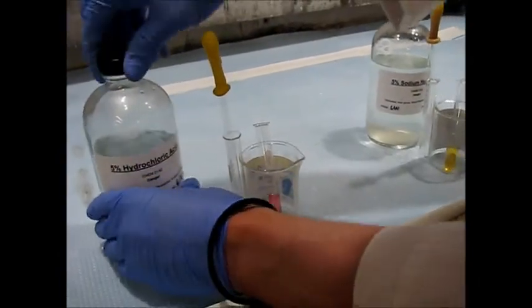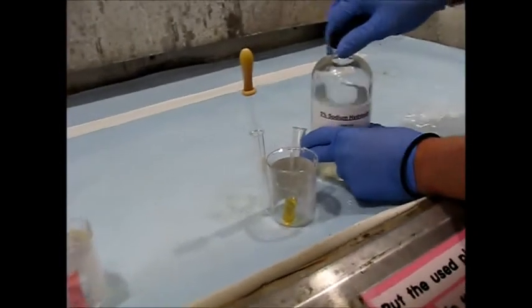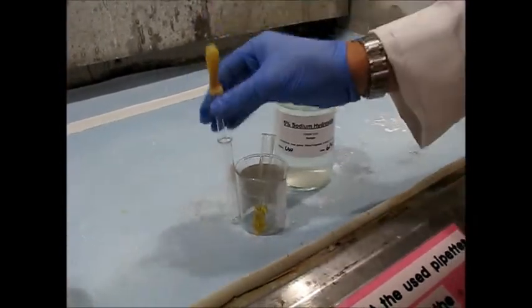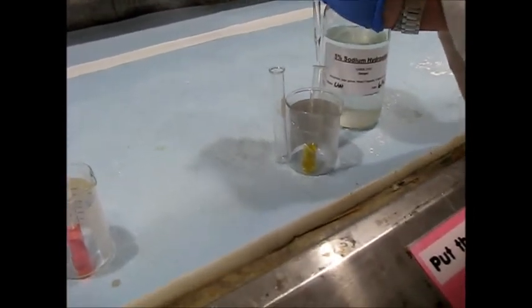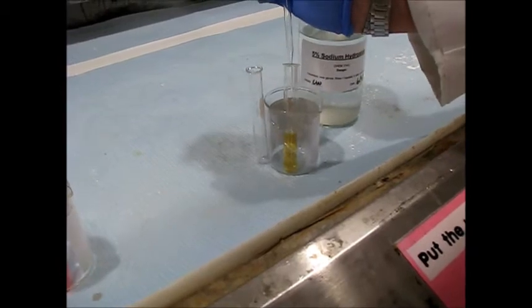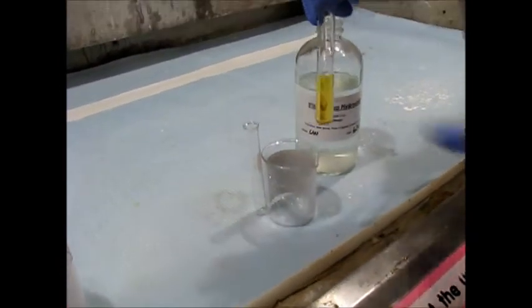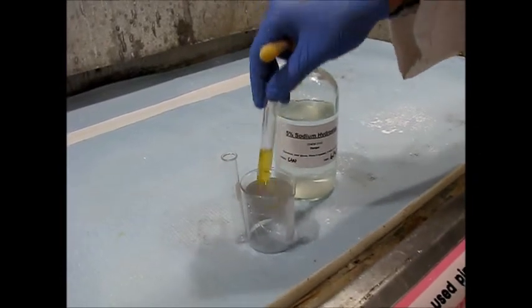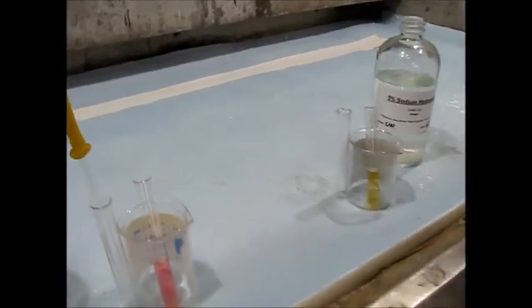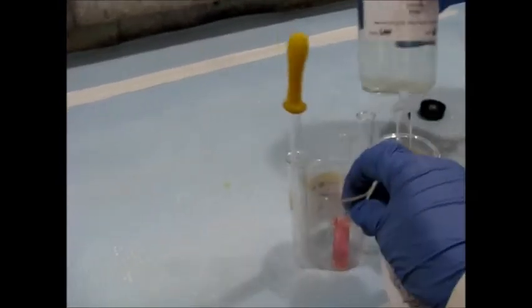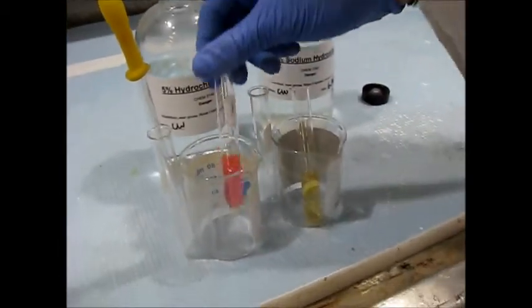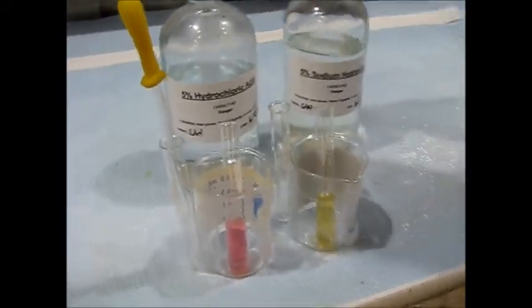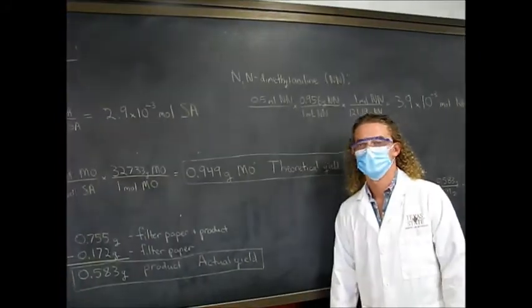So now we're going to test sodium hydroxide. It should turn kind of like a yellowish-orange kind of a color. It's already pretty pale yellow, but we'll see if we see a color change. Yeah, so no real color change. It actually got a little bit darker, kind of. But yeah, no real color change because it's already pretty yellow. As we would expect for something like a basic solution, we would see it kind of yellowy. Whereas acidic solution, we would see kind of more reddish color.